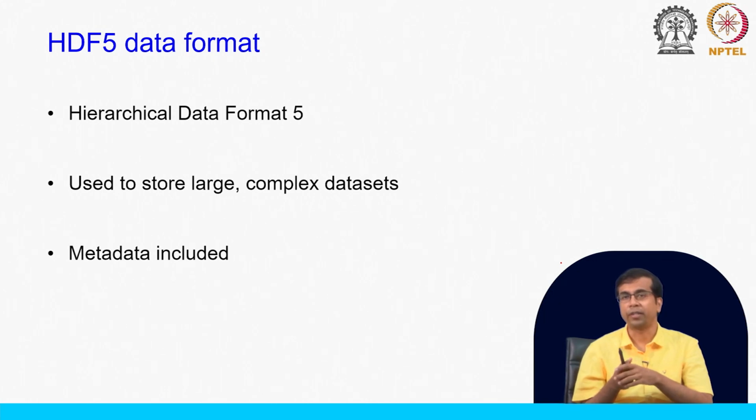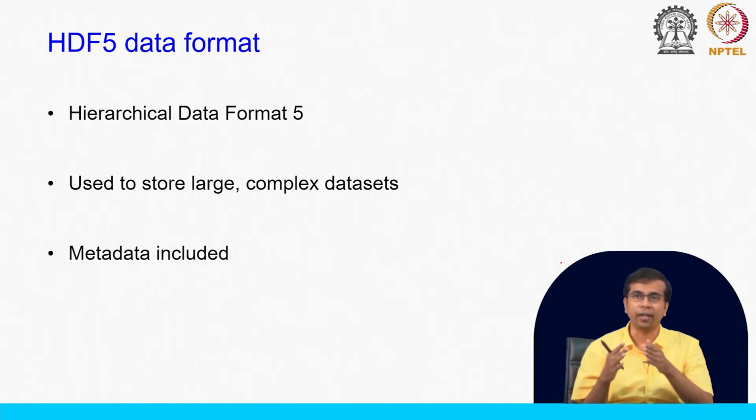As you have probably seen, in many cases we have this HDF5 format. We have seen it in the case of SMRT, which earlier used HDF5, and here also we are seeing FAST5, which is a variant of HDF5, actually a simplified version of it. The name HDF5 comes from hierarchical data format, and this is version 5. You can also have the earlier versions, HDF4, etc. This data format is used to store very large complex data sets. It is not just for storing this next generation sequencing data, it can be used for storing other different types of data sets.